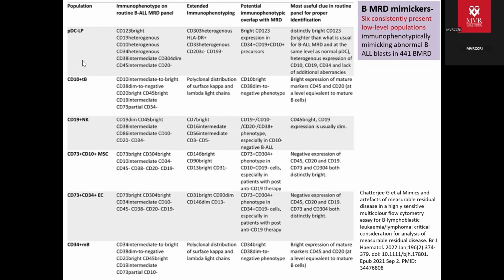It will help us to see the sample quality, assess the normal hematopoietic cells, whether it is dilute. We can detect new subclones or a lineage switch in flow cytometry. Even without a diagnostic sample, it's possible to do MRD analysis in flow cytometry. For T-ALL, it is preferable to have a diagnostic sample because analysis of T-ALL is a bit more tricky.